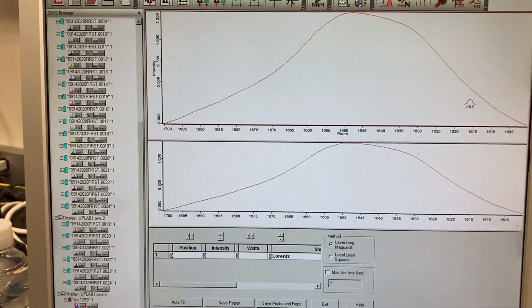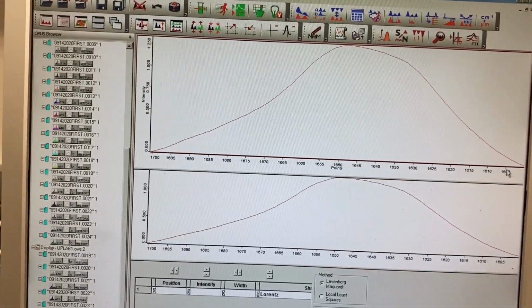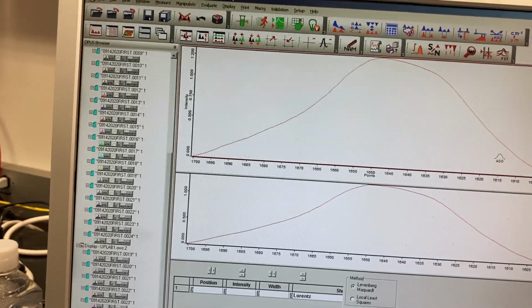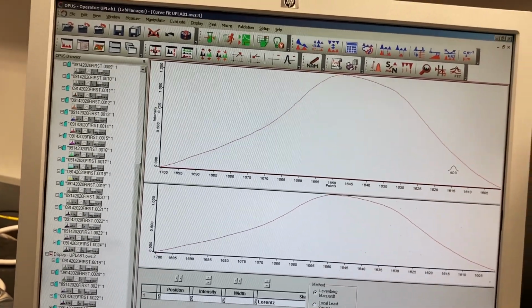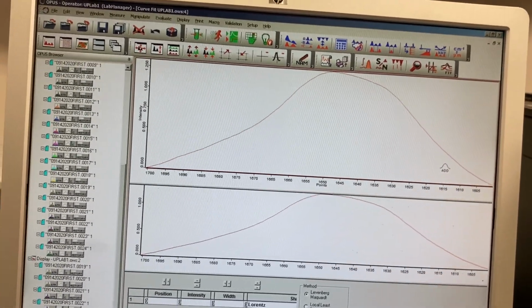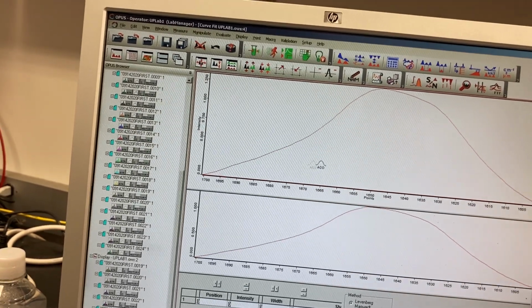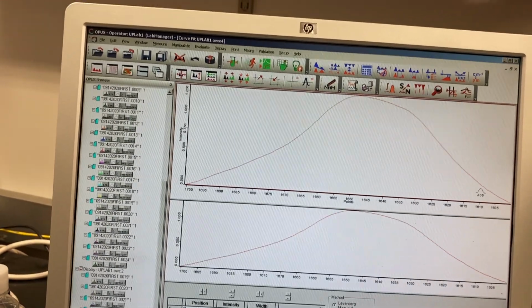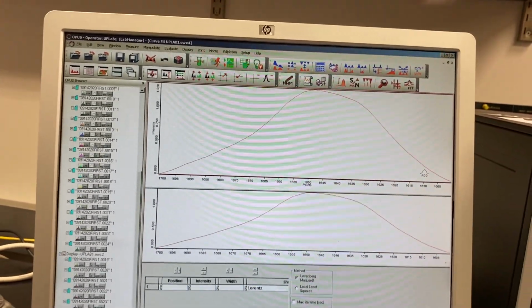And then if you look at the second derivative spectra in detail from 1600 to 1700, you will see 5 minima. But studies show, and so many of our collaborators and reviewers of our paper suggest, that there should be 6 minima. And the selection of the number of minima, the selection of the Gaussian bands, should follow some studies.